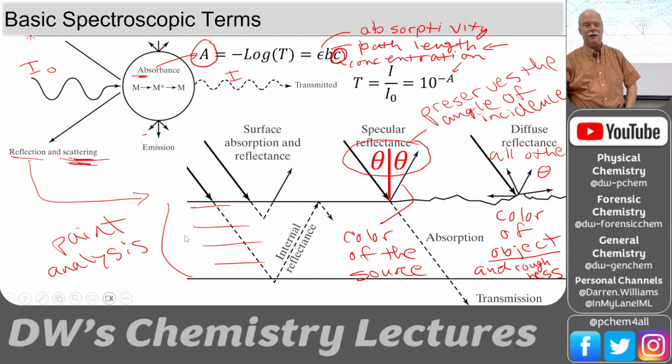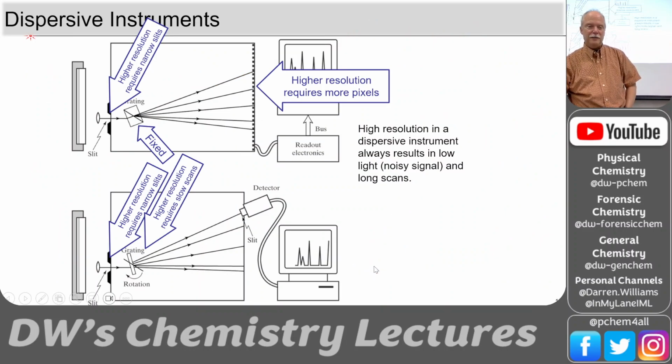Can't imagine how much that costs. But that would be very forensically relevant, right? If you had a very specific paint chip, you're like, okay, this thing is crazy. I look at it in a microscope, and you need a tilting stage probably. Okay, then let's look at different instruments too.